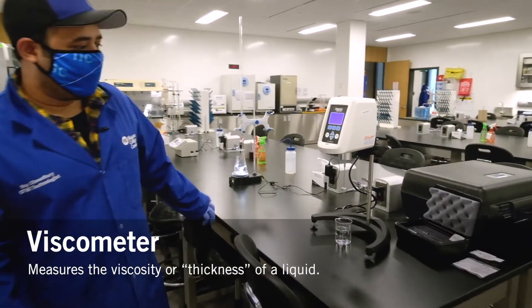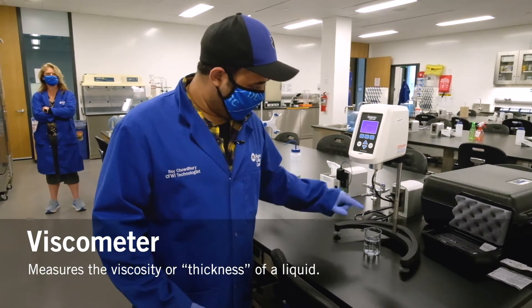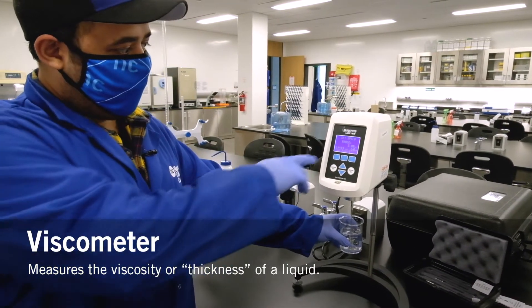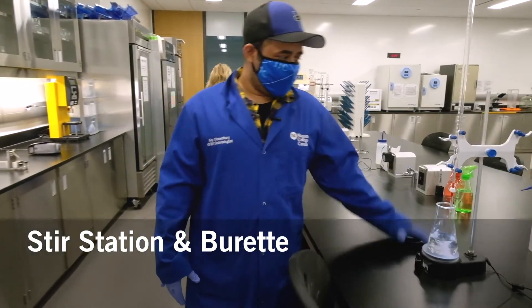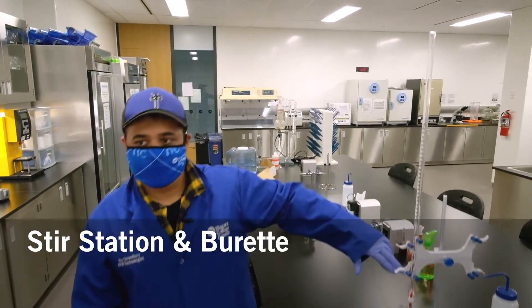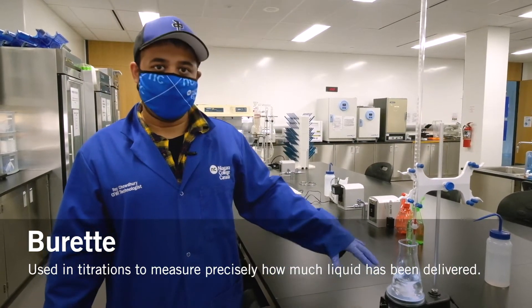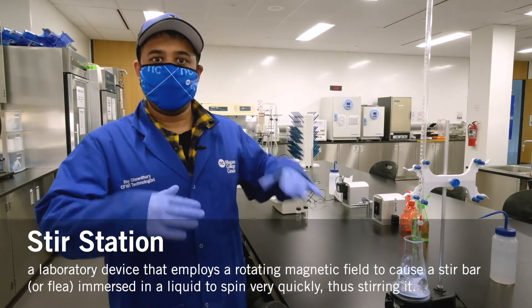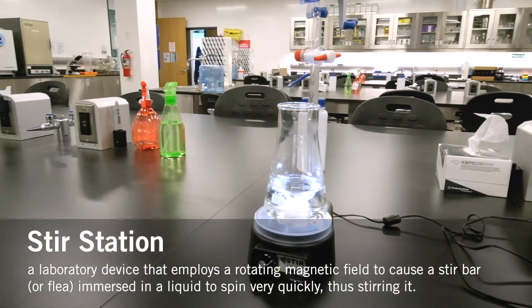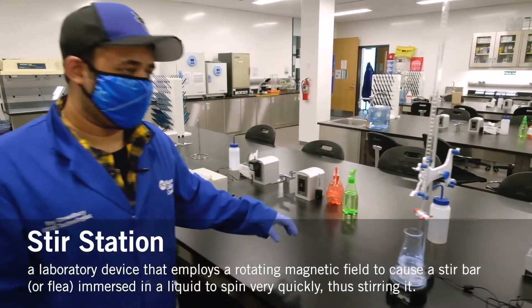The next equipment is a viscosity meter. Basically it measures the viscousness of the sample being tested. There's a probe attached here, and based on the resistance accumulating it gives you a reading. We also have a stir station and a burette, which is essentially used for titration. It's typically filled with a base, and what's being tested against it is an acid. It also has a color indicator which gives an endpoint when equilibrium is reached. As you can see, it's rotating to ensure the base being dispensed into the acid is evenly distributed. Once it reaches the endpoint, it gives a pink indication that the titration is complete.